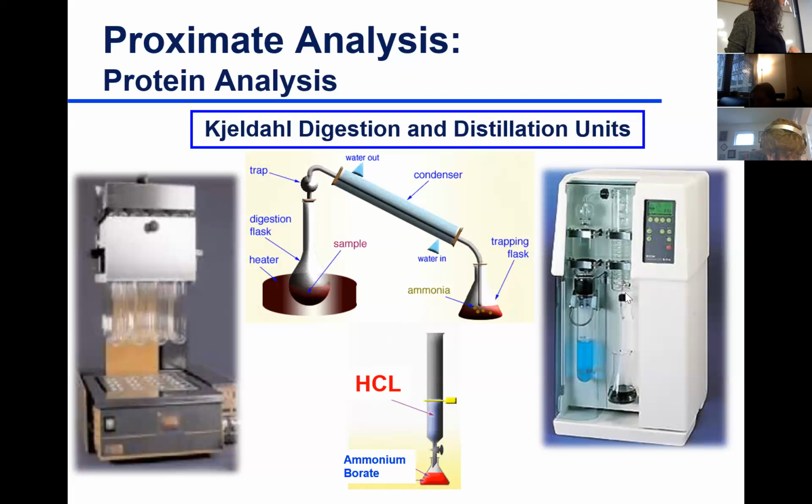So at this point, this is the other unit that we will be using. Here you have your ammonium sulfate, and you have some excess H2SO4, sulfuric acid. So what we do is neutralize with NaOH. The NaOH is going to neutralize the excess acid and some of it is going to react with your ammonium sulfate.